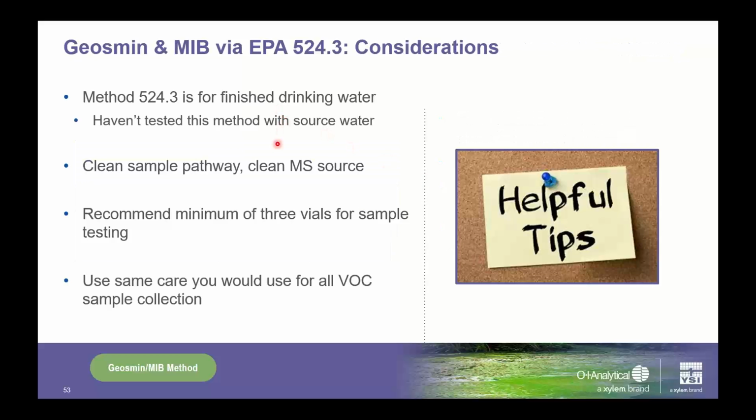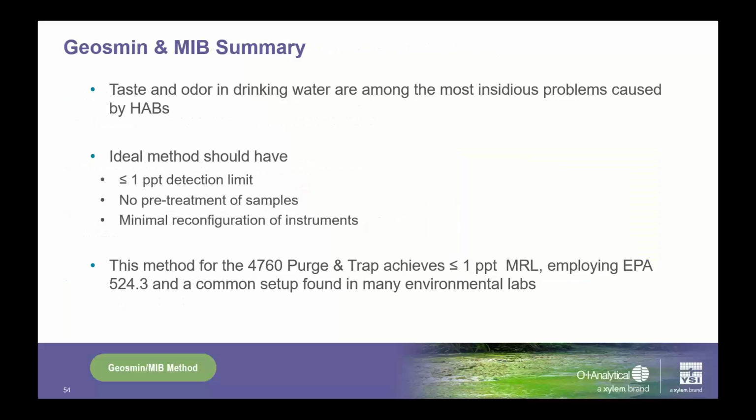So to wrap this one up, the one thing I want to point out here is that when you're trying to get the level of sensitivity that we got with this method, you're going to want to have a lot of replicates, and you're going to want to use pretty clean water. We have not done this with source waters. We've done this with finished drinking water. We are getting ready to trial this method with water from an aquaculture system, actually, and we'll look forward to providing those results for you.